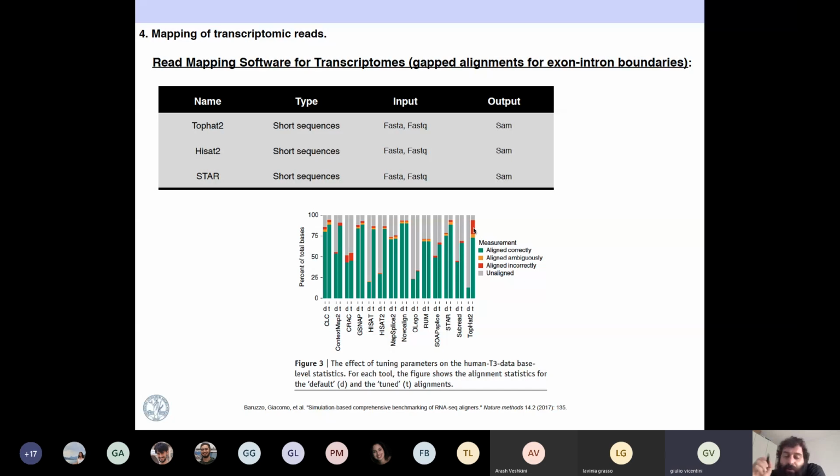Okay. And also the second question is, let's say I have 30% of unmapped reads. How can I search for contamination? Because contamination can be from humans, but also bacteria, fungi. So how can I search what are those 30% of my reads? Usually what I do is I assemble them with a program to assemble transcriptomes, like Trinity, and then I blast them with the NCBI database and check and see what is there.